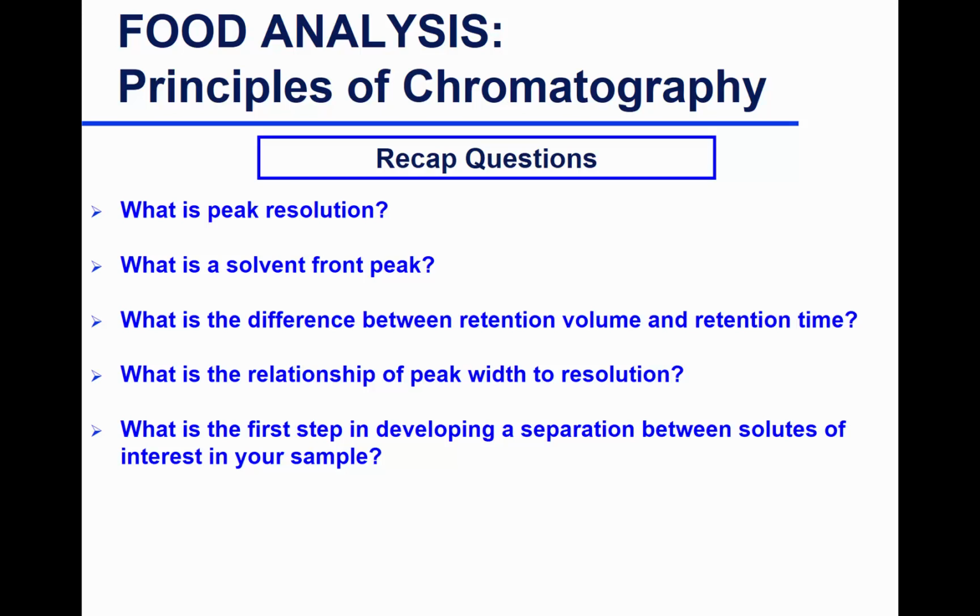What is the difference between retention volume and retention time? Retention volume is how much of the mobile phase you need for the solutes to come out. Retention time is how long it takes for the solutes to come out. Perfect. So the retention volume is the volume of solvent or mobile phase it took for a particular solute to come out, whereas retention time is the time needed for that particular solute to come out. And in chromatography, we often refer to retention time more than retention volume.